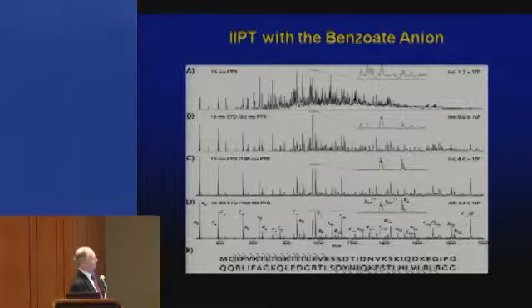So in an experiment that takes 100 milliseconds, you've just read the amino acid sequence from the N terminus and the amino acid sequence from the carboxy terminus in 17 amino acids. You can't go any further because the mass range of this instrument is 2,000. All right, so you know the molecular weight that you started with from the electrospray spectrum. You know the amino terminal sequence, and you know the C-terminal sequence. You can identify any protein in the database.